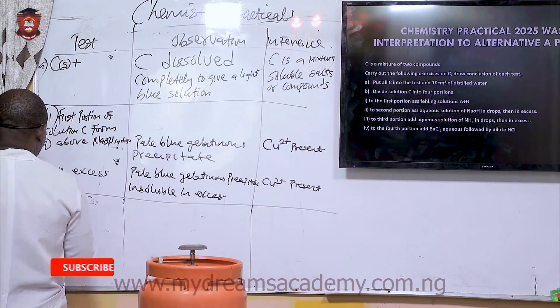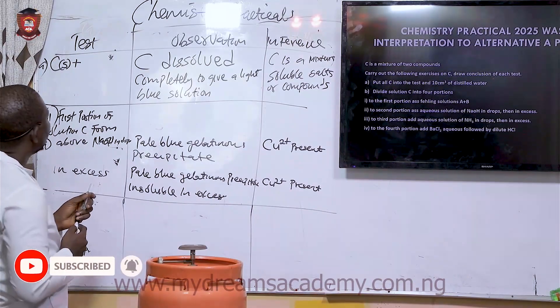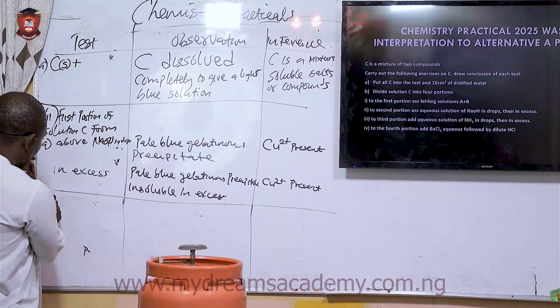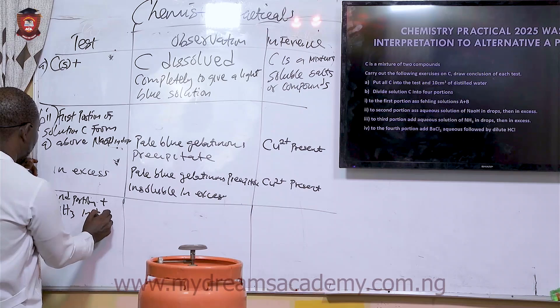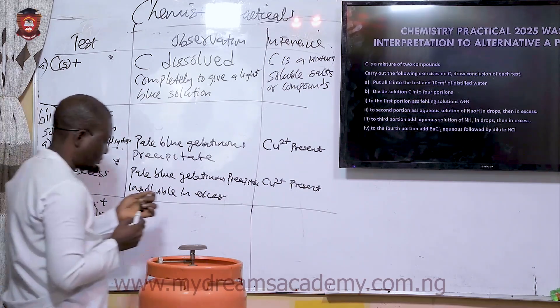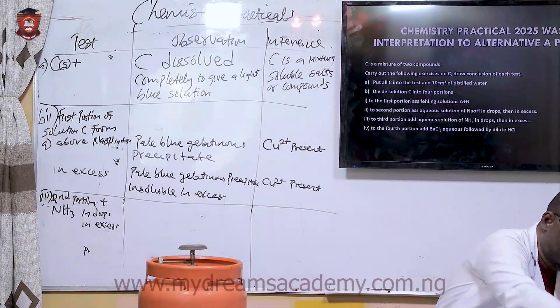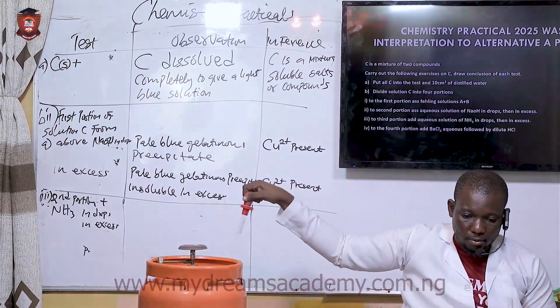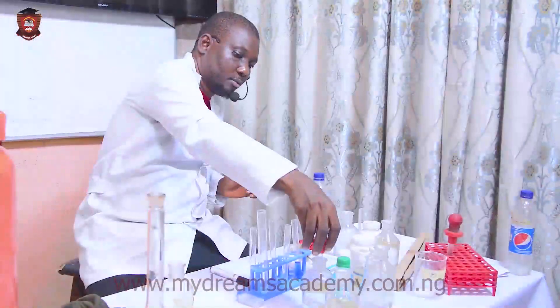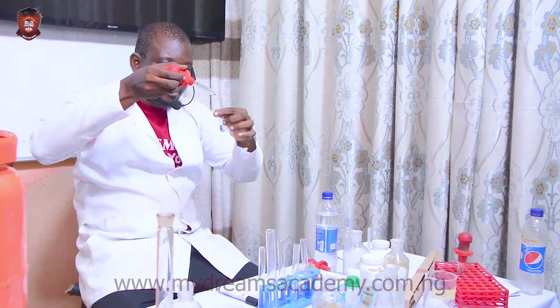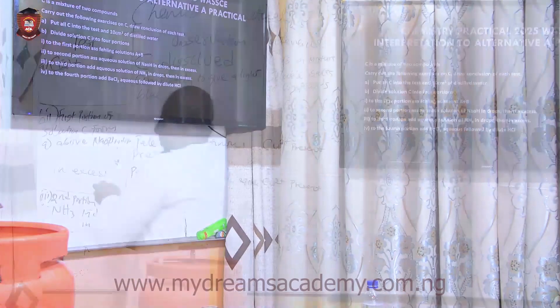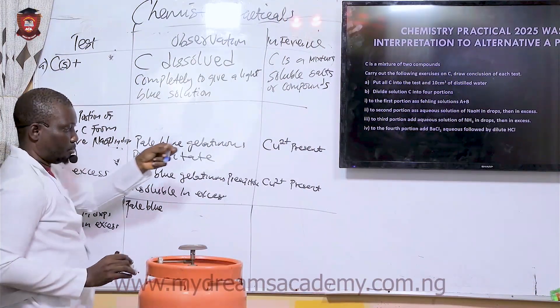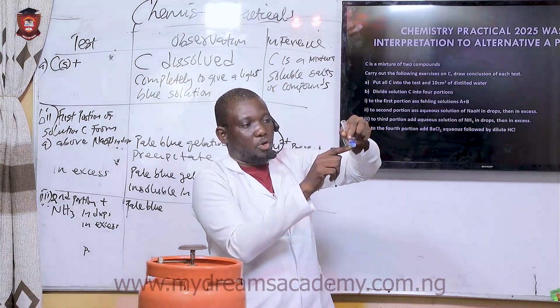I still want this test. Add ammonia in drops, then in excess. You see — please look down — what are you seeing there? A pale blue precipitate. If you waste time, the copper is forming a ligand, so pay attention. Pale blue precipitate forms in drops.